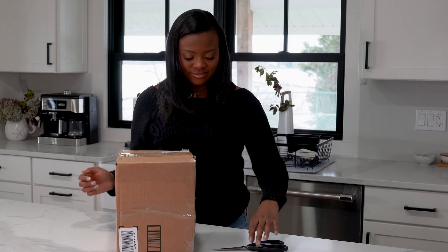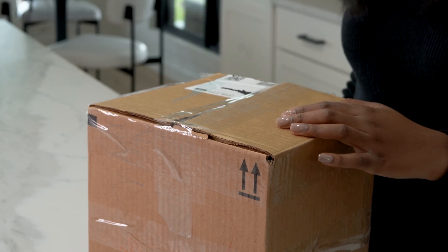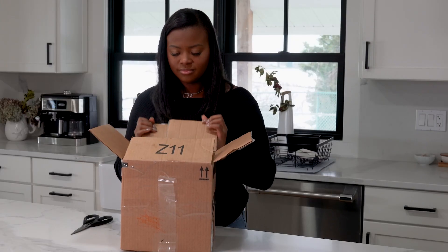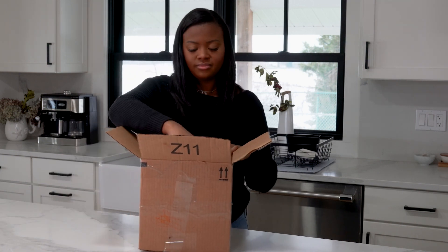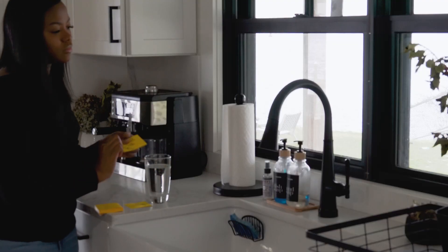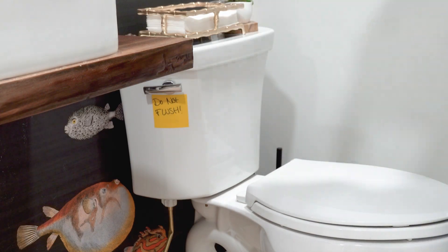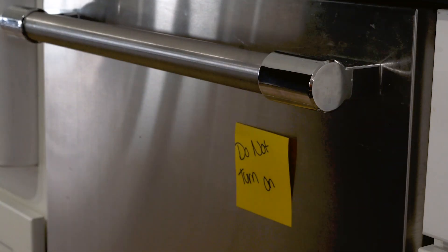You have received a box of sampling materials from your utility company. Make sure you read the included instructions in full before you start collecting, and make sure that you plan ahead to sample correctly. We recommend collecting all samples first thing in the morning or after everyone has been out of the house all day, since the water has to be sitting untouched for at least six hours. This means no turning on the tap, flushing the toilet, or running appliances like the dishwasher or washer. You can put up notes to remind others not to use the water during this six-hour period.